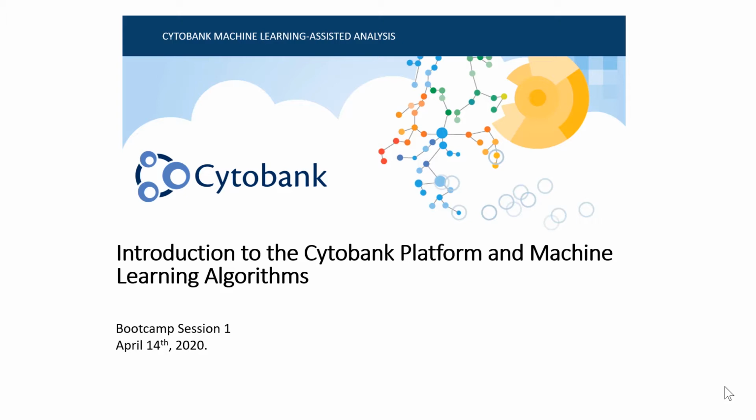And today I'm going to be talking to you about the Cytobank platform and the machine learning algorithms that are found within it. So this is the first session of our bootcamp that we're running throughout the month of April.